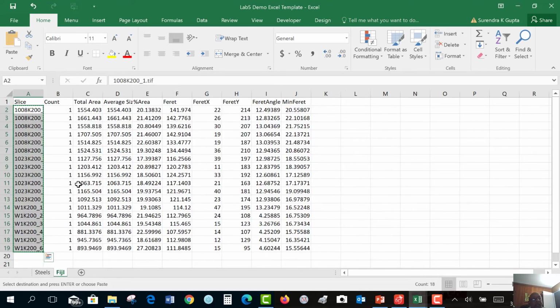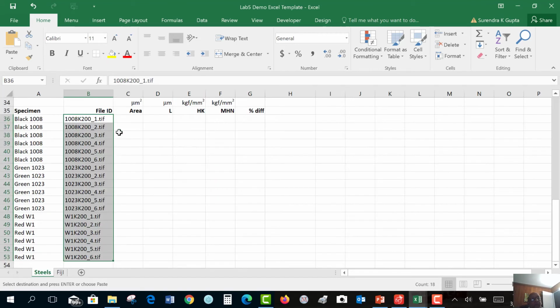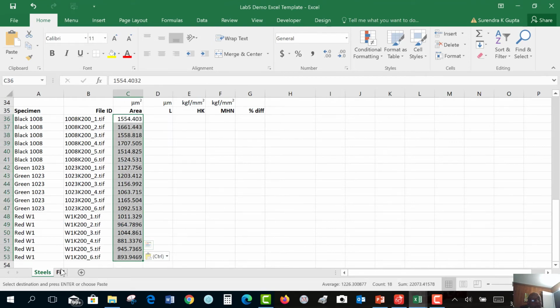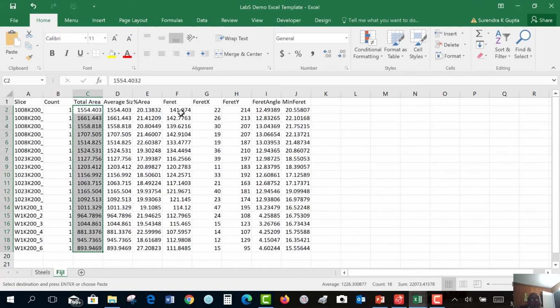I'm interested in area. And I am interested in Feret diameter.